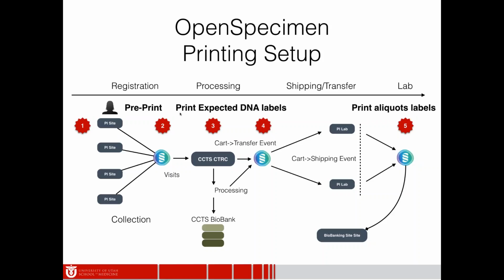And we have a lot of labs that have backlog ready to be put into OpenSpecimen for processing at the CTRC. Once we have that workflow moving as quickly as we can, then we'll start working with labs to build in their inventory of back samples that are in storage. So if anybody has any questions, I'll be happy to answer.